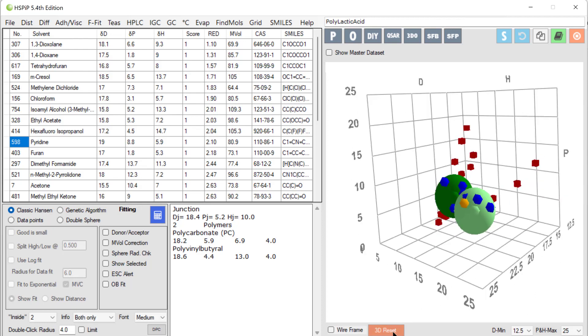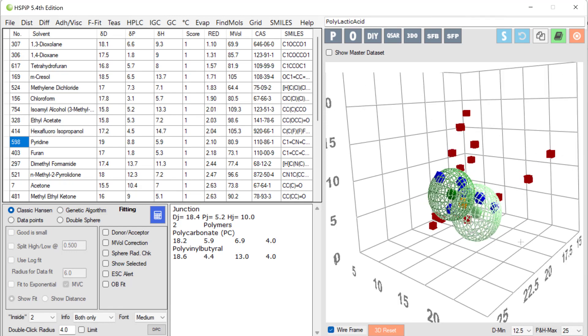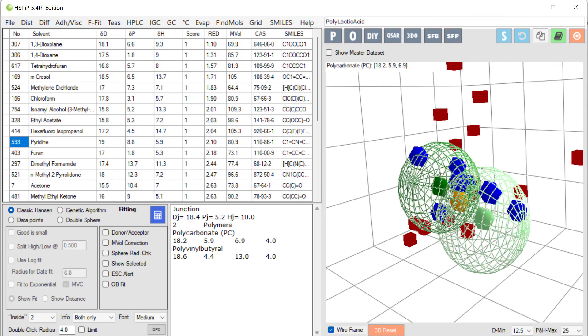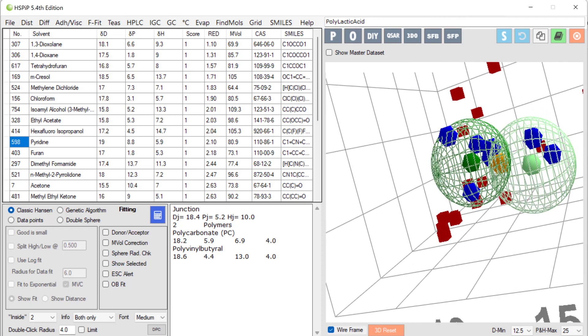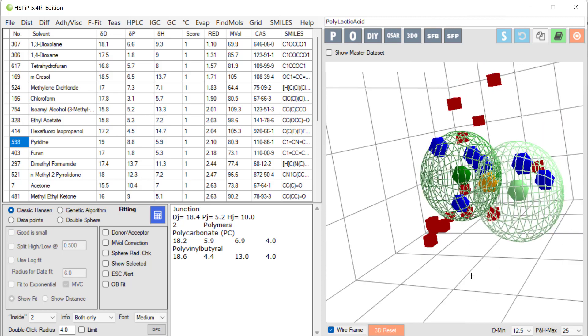It's a bit clearer if I turn on the wireframe and I can also zoom in on this a bit. So I can look more closely. You see in there a golden ball. That's the junction. That's the solvent which would be best for both of these polymers.